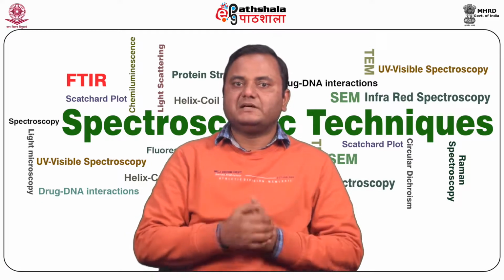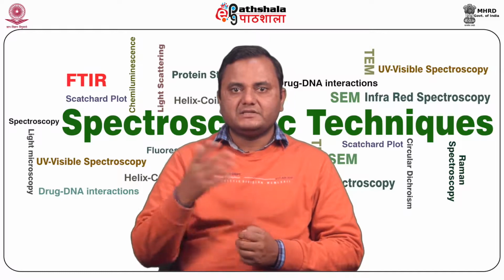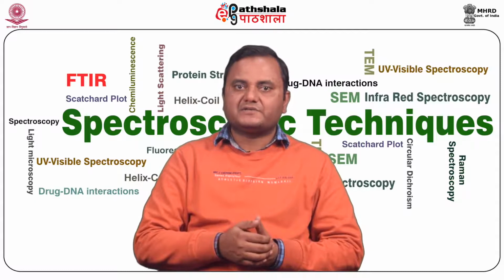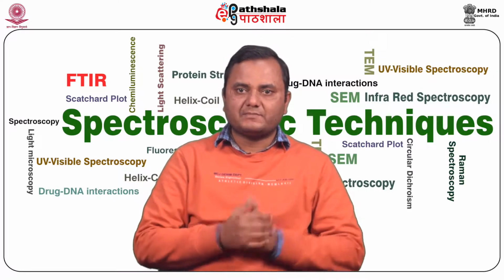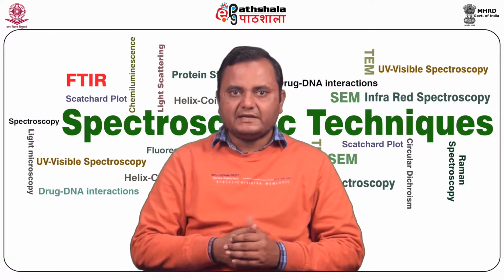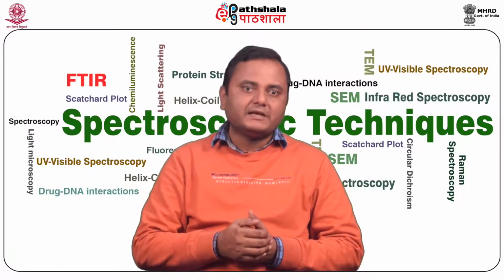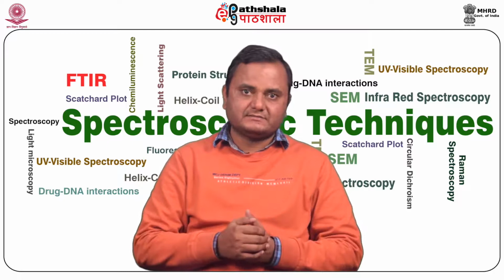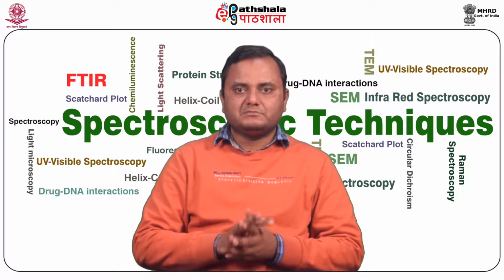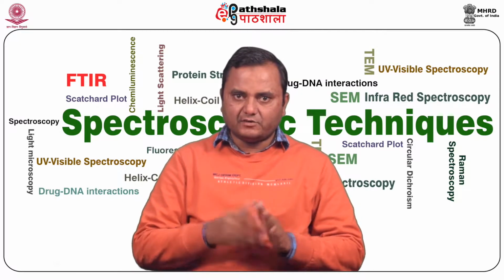Purge the instrument with nitrogen before using. Oxygen will be converted by the UV to aggressive ozone, which is why nitrogen purging is essential. After switching on, allow 30 minutes to warm up. Check the stability of the instrument by the drift of the baseline, and regularly calibrate the equipment by using a calibrating agent. The lifetime of the light source is approximately 1000 hours, so don't keep the instrument on all the time. Start the light only when you need it.